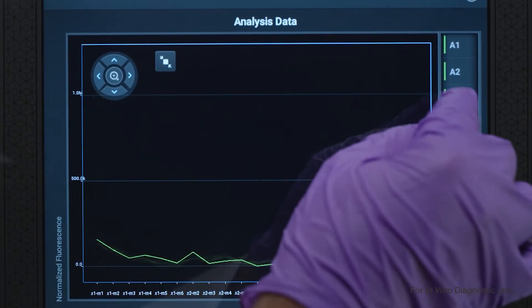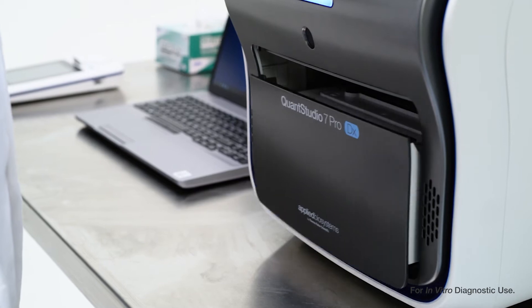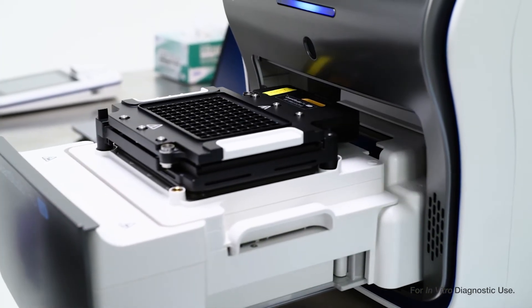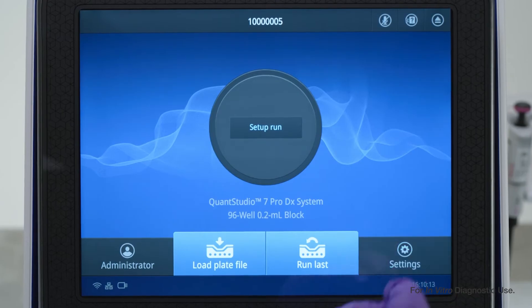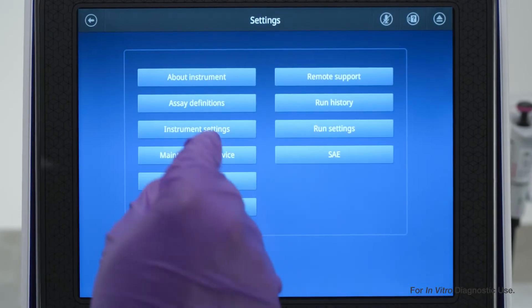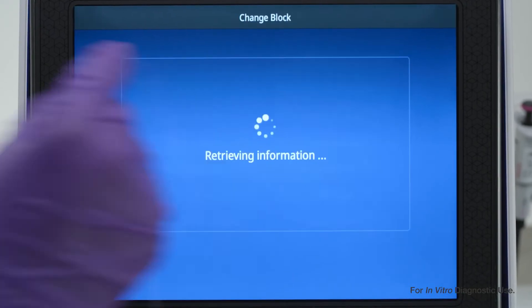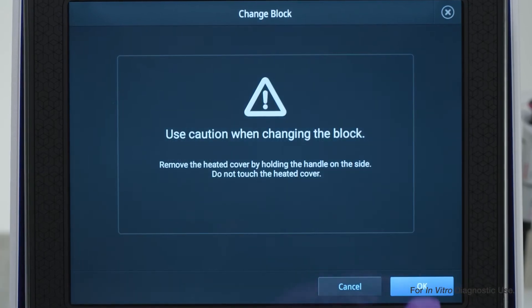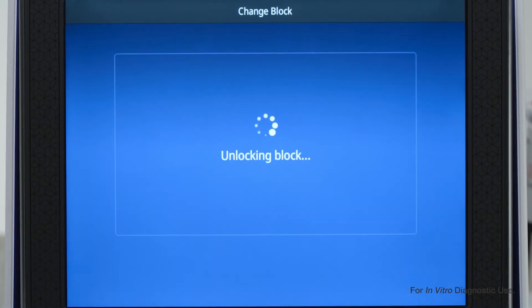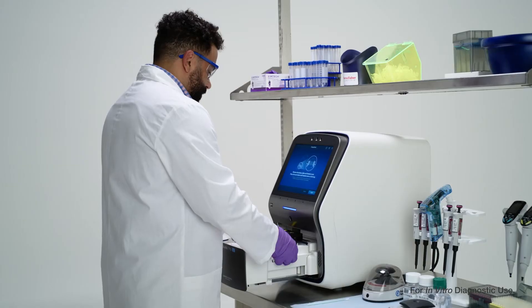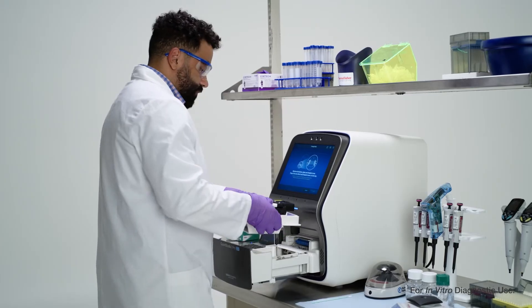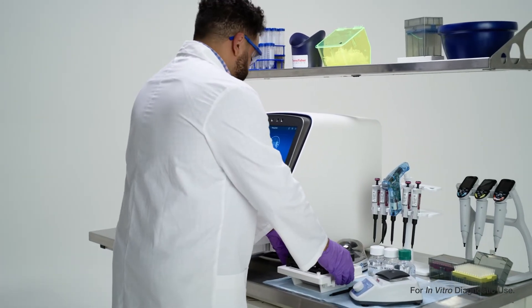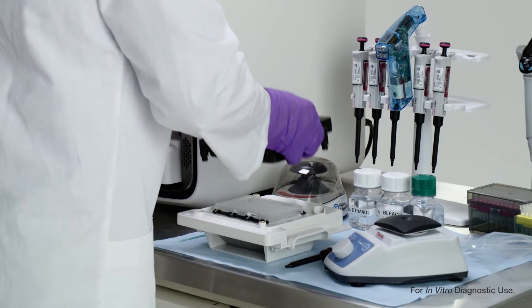If you discover contamination, simply remove the block from the instrument and clean it. Go to the home screen, select Settings, then Instrument Settings, and Change Block. Select Change and tap OK to unlock the block and heated cover. Use the handles to easily remove both, and if you're removing the block for an extended period, store it in a safe, enclosed location.